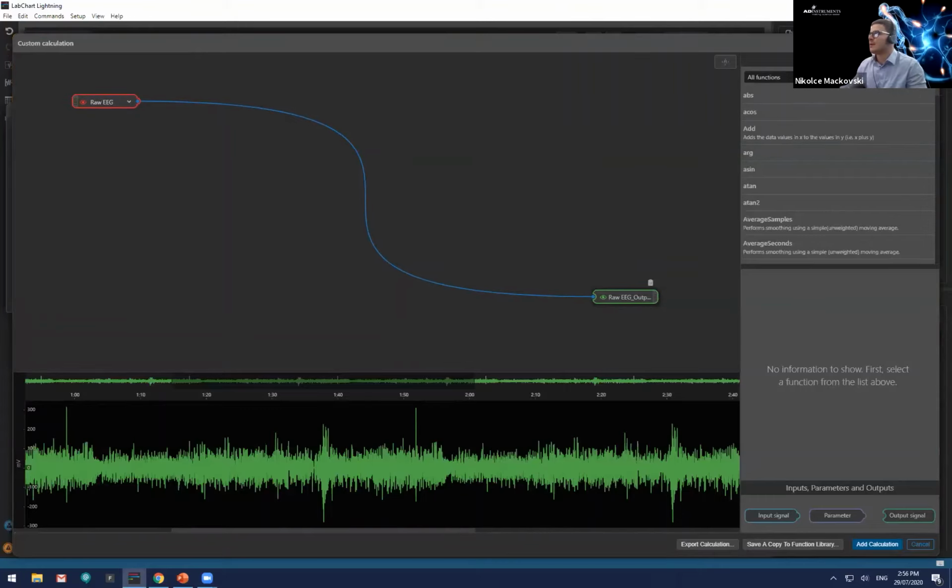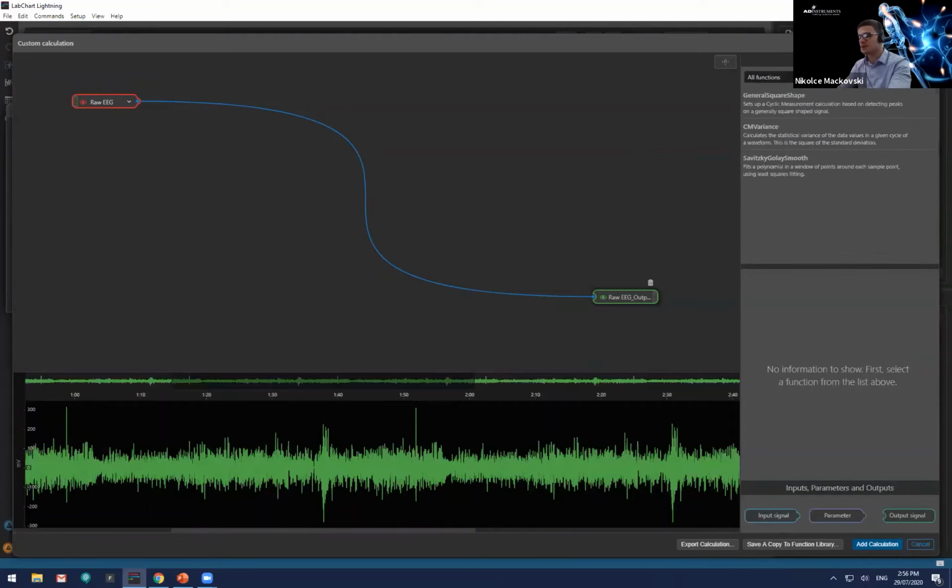So to do that, we're going to look for power. Sometimes even if you haven't got the right word you put in, just anything similar to this also works. So if I type in anything else, sometimes that can work for you as well if you don't know what it is. But otherwise, searching throughout each function for the type of calculation you need also helps. But here I've found power.